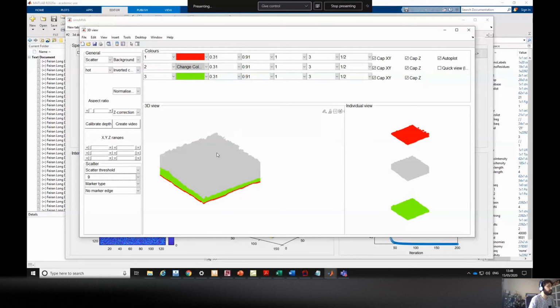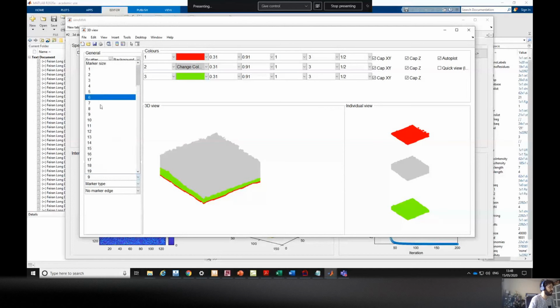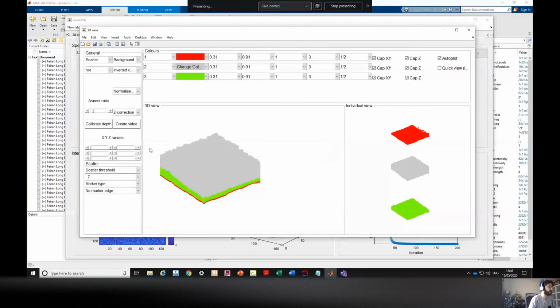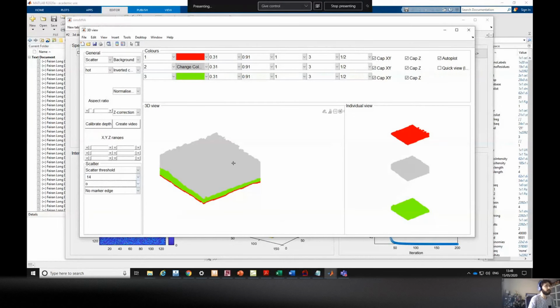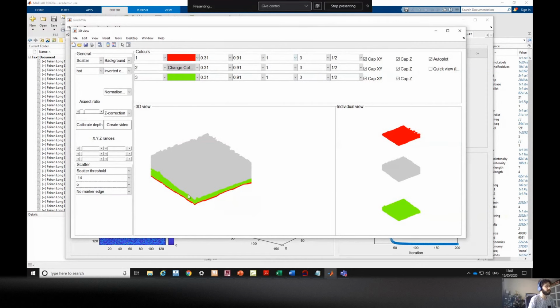Yeah, in this case, it becomes quite similar. The rendering will be nice because it shows response to some light, some fake light in here. And these are just flat points. And you can also change the marker type and these things. Yeah, like X's. X's are too small, I think. So yeah, that's how you explore a 3D view of your NMF results. Again, this sort of overlay is good for non-negative stuff. So PCA will not be able to do this.